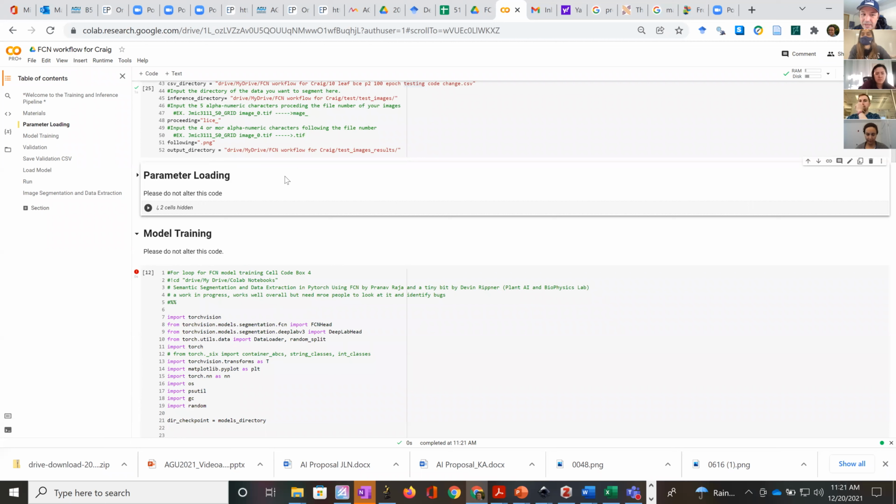for this code. And so this is just kind of a background operation. There shouldn't be anything that you really have to change here. So you're just going to run this. And all it's doing is something called a batch normalization. So most deep learning code needs to be batch normalized. So it just needs to learn what the parameters are on the images it's learning from, and then it will apply those parameters to any images that it infers on.